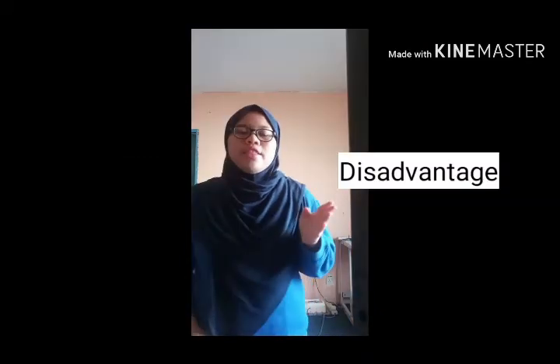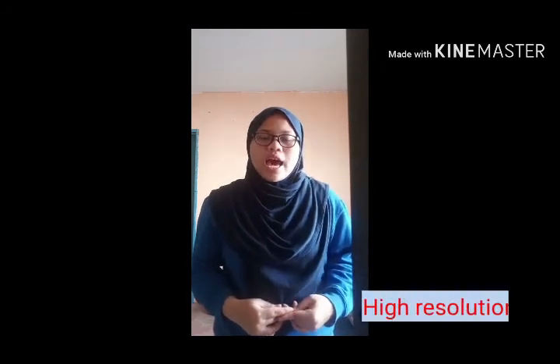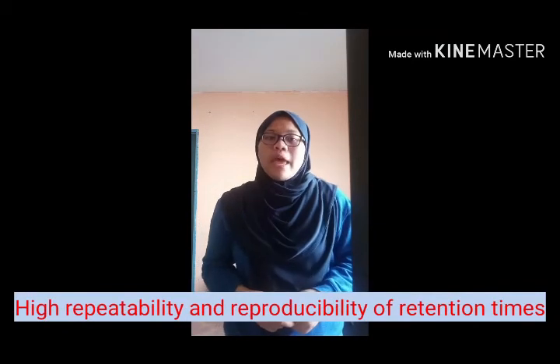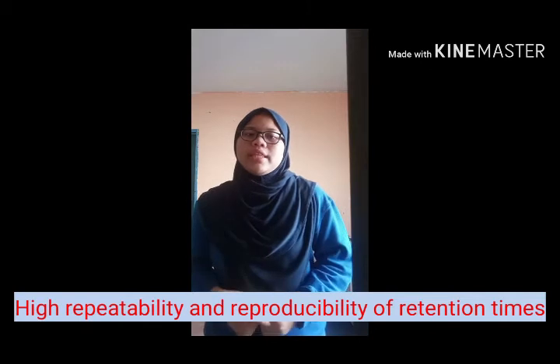Today I want to present the advantages and disadvantages of gas chromatography. First advantage of gas chromatography is high resolution power compared to other methods. It is shown by the sharp and symmetric peak. Next is high repeatability and reproducibility of retention time.